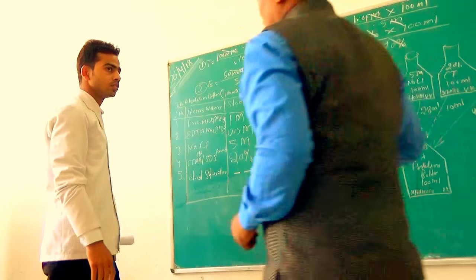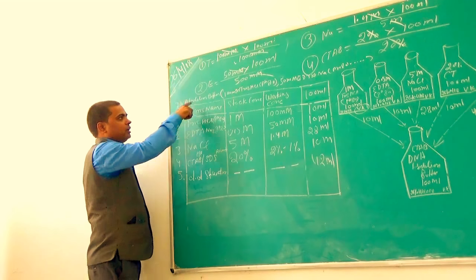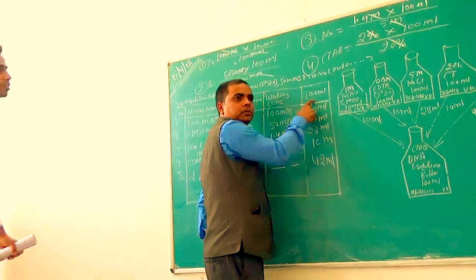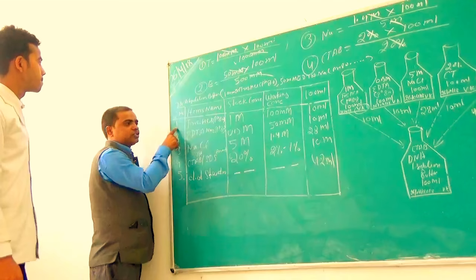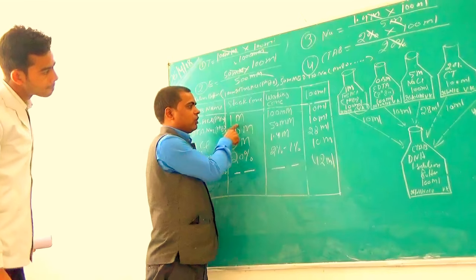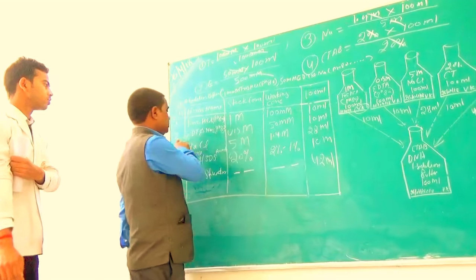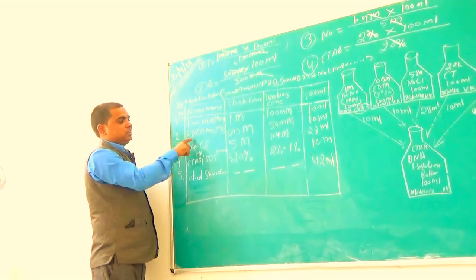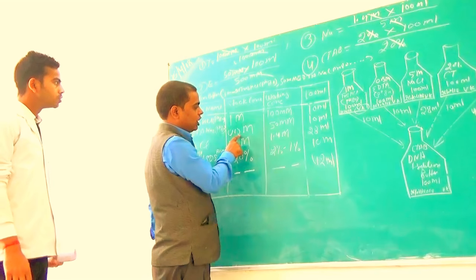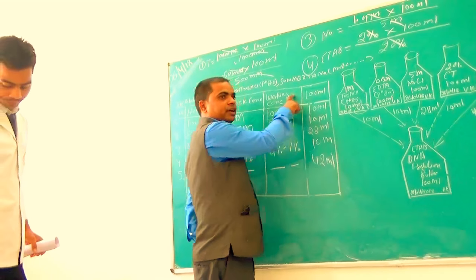We are going to explain this table here. Serial number, item name, stock concentration, working concentration, 100 ml. First compound is Tris HCl, pH 8, stock concentration 1 molar, working concentration 100 millimolar, and then compound number 2, EDTA.Na2, pH 8.0, 0.5 molar, 50 millimolar is the working concentration.